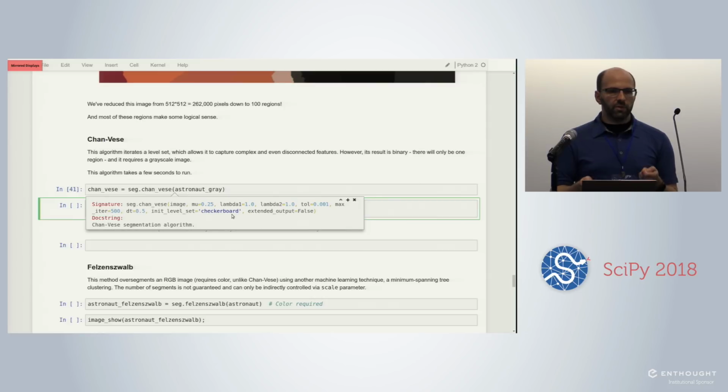And then over time, instead of moving the actual individual points around, it's changing the way that it's bent in space, positively and negatively. And then the level part of the level set is where you threshold that, usually around 0. And so the positive aspects of that level set end up being the result of your image, and the negative aspects end up being excluded, or vice versa. It's a very powerful technique, although it does take a few seconds to run.